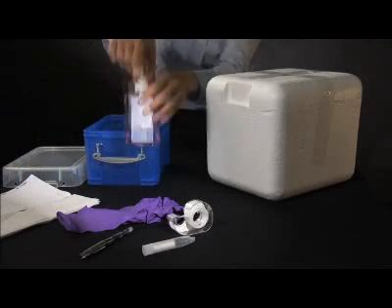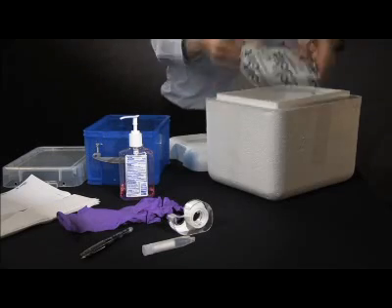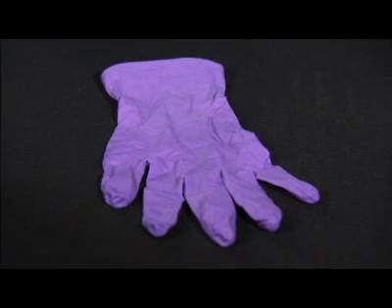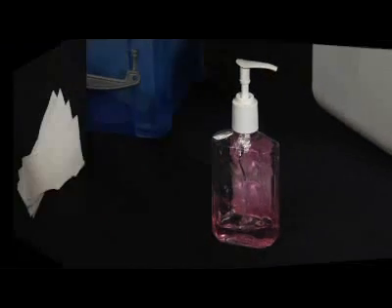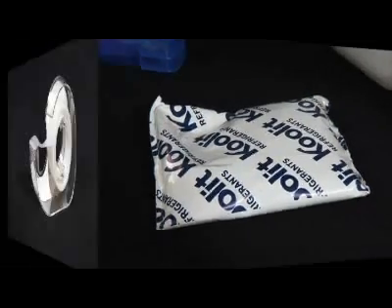When we go into the field, we prepare collection kits ahead of time to help better keep us organized. The collection kit for saliva contains gloves, salivettes, which are a tube plus cotton pads, hand sanitizer, paper towels, cooler with ice packs, tape, and weatherproof labels.